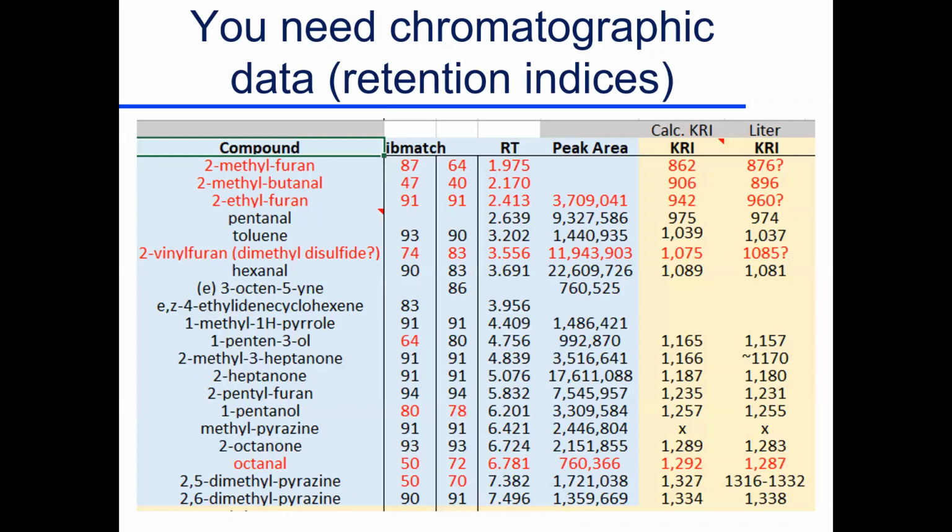The next positive bit of data that you need is retention indices. Retention indices are basically, let me see if I can draw this.